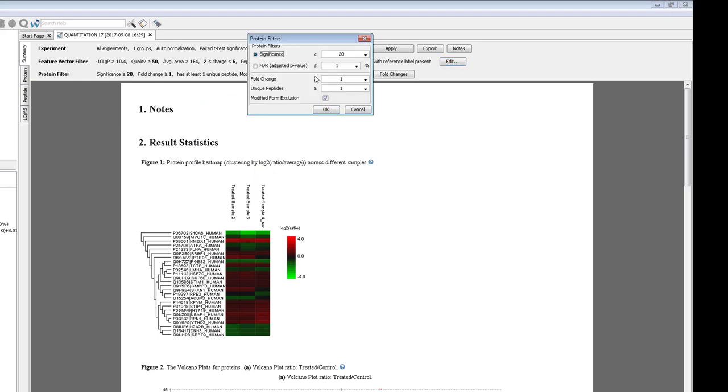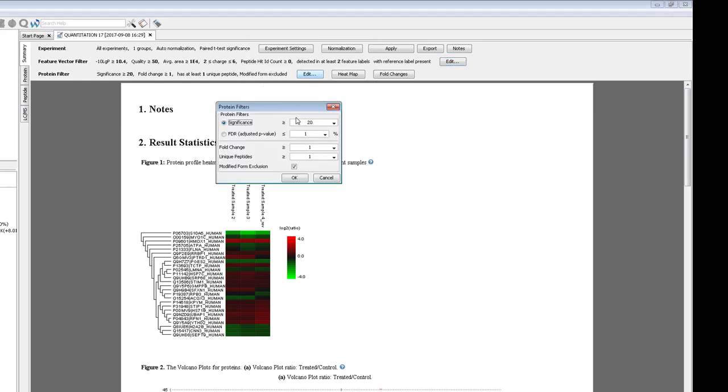This is a statistic that determines how likely the change that's observed is caused by more than random chance. We use minus 10 log p, so a significance filter of 20 equals a p-value of 0.01 or less. This represents a less than 1% chance that the change that's observed is random.